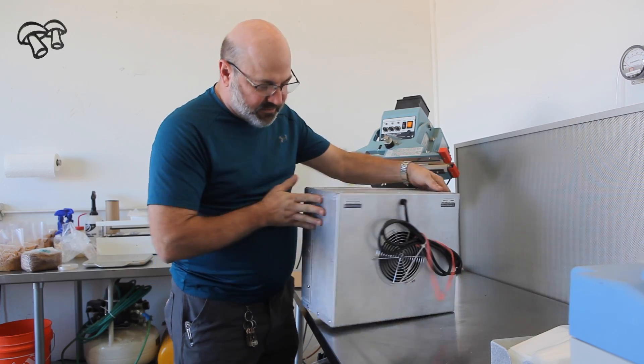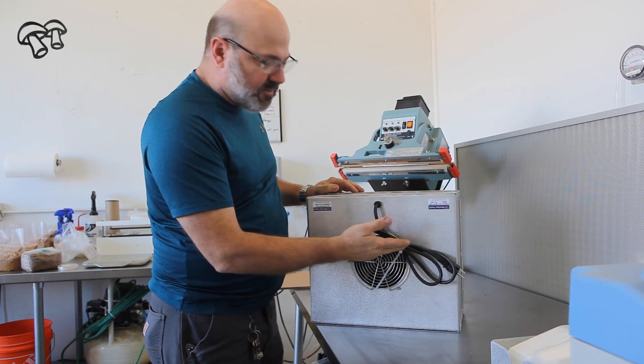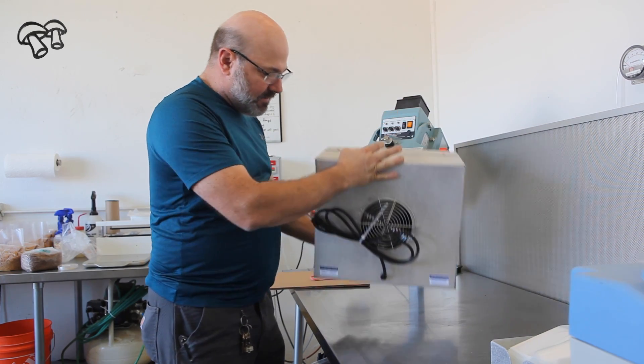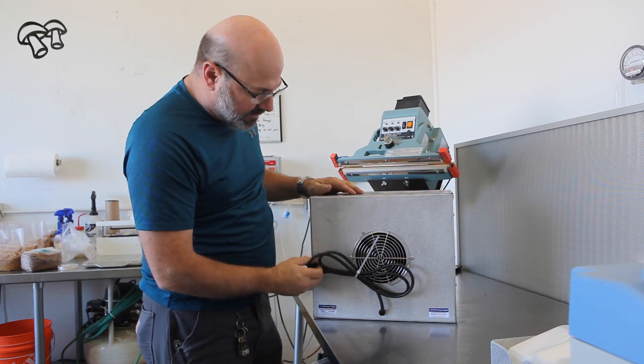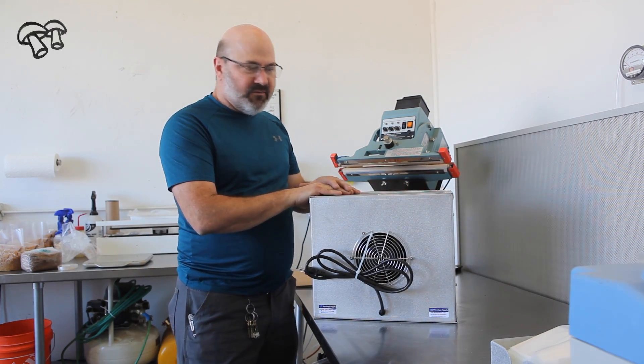You can see it's a nice little compact unit. When it comes to you, the cord is bundled — you want to cut the wire tie. You operate it simply by just plugging it in. Plug it in when you use it, unplug it when you don't use it.